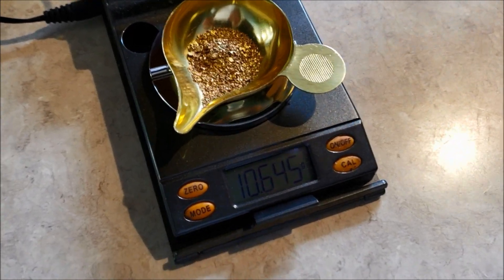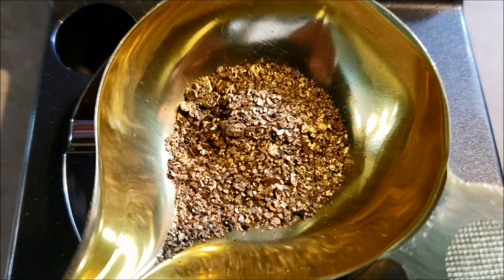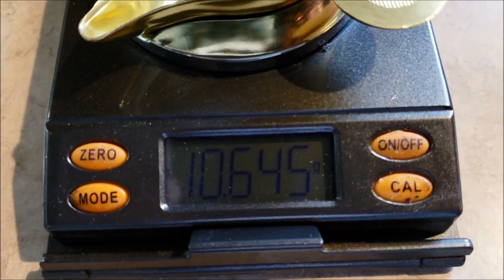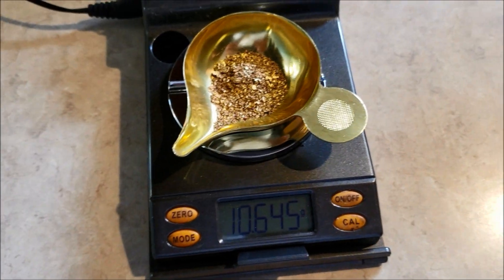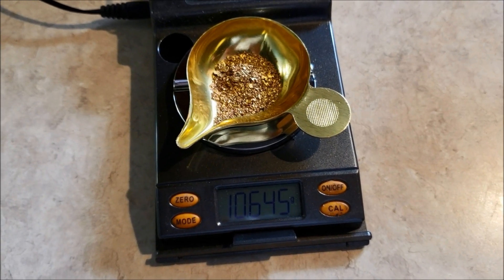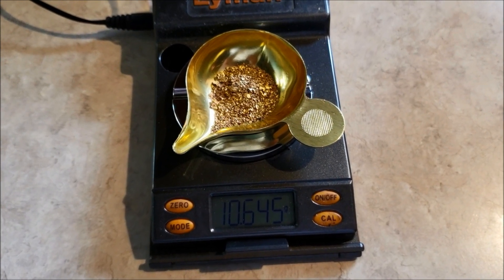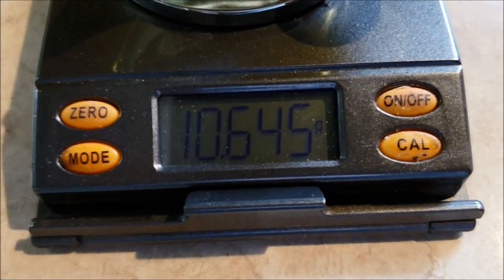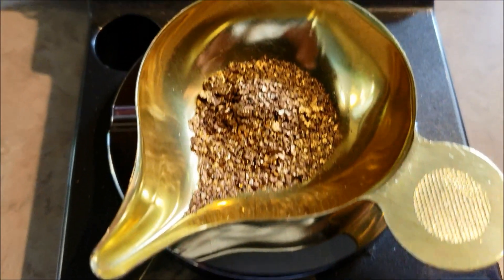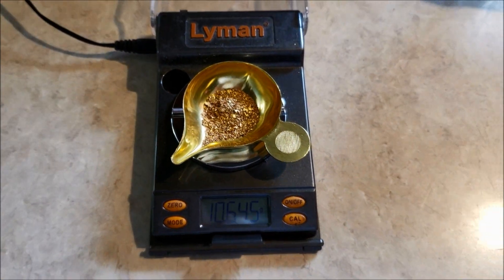Alright, so I thought I'd try a little experiment. This is gold that we found panning and mining. We have 10.645 grams. I'm gonna dissolve it in aqua regia, then drop it with SMB, heat it up and make a little coin. Hopefully we can still have 10 grams of gold when we're done, but I bet it won't be quite that much. Stay tuned.